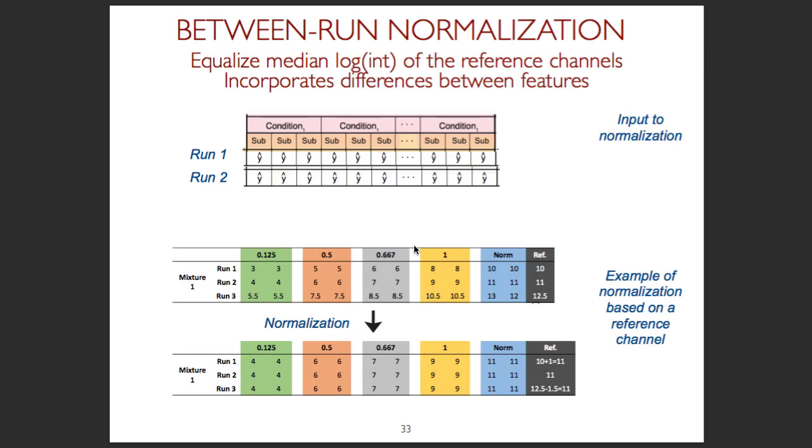And now we have a much simpler data structure where at least we summarized all multiple MSMS spectra into a single spectrum. And at this point, we can work with statistical methods which would account for various allocation of subjects to conditions and runs. But before we do that, we need to normalize, because still run 1 and run 2 may be based on summaries from different spectra.